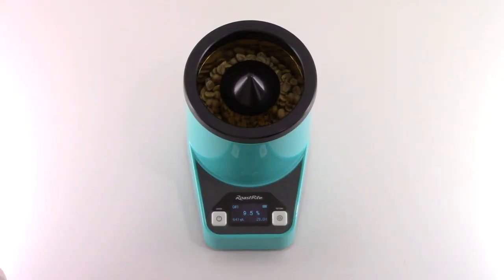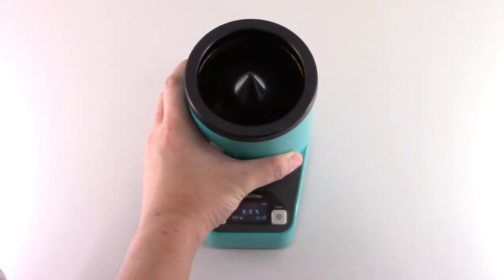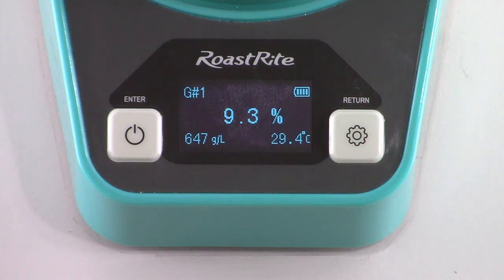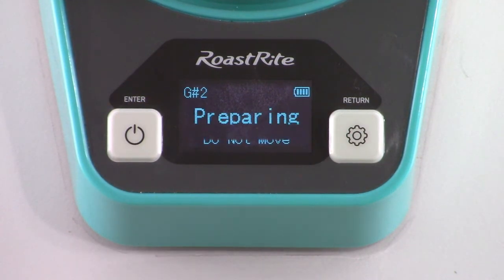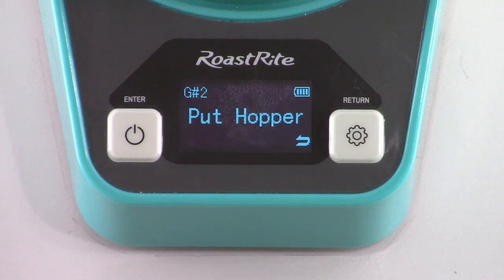Alternatively, multiple additional tests can be run and have the data averaged automatically. To start another measurement, clear the sample from the device, follow the same steps to fill the sample cup, then press the left button to continue. The number on the top left of the screen will change to 2, indicating it's the second measurement.